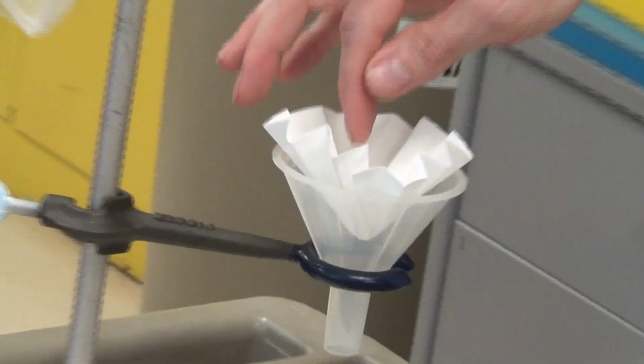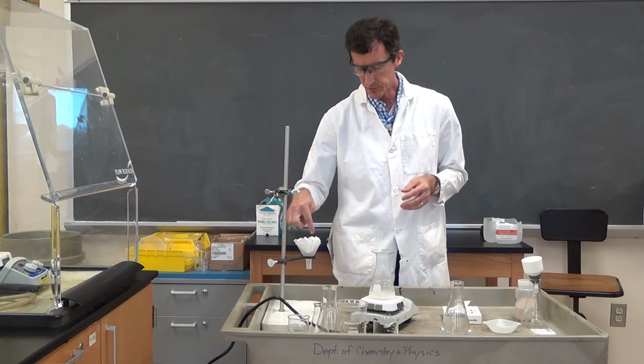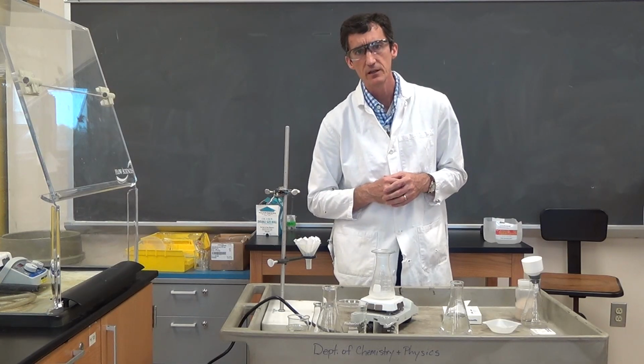We're going to filter this. What's the purpose of filtering? What will we remove when filtering? That is when the insoluble impurity will be removed, which in this demo is our sand. The sand will never dissolve in the solvent.